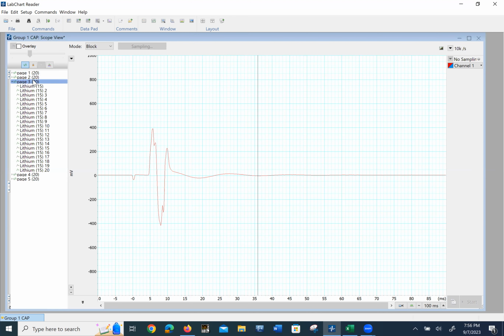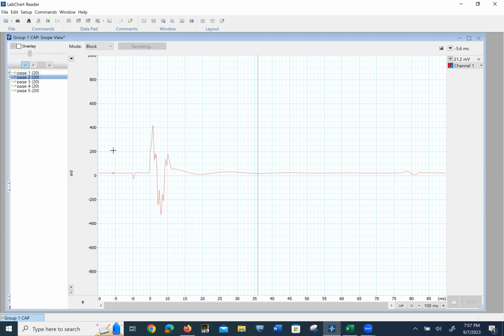Okay, now I'm going to choose the next 20, which is really what? That's 0 time. Let me just pick the peak up there for that. That time is now 5.9 milliseconds. So it's delaying, it's getting longer. Okay, 5.9. Now I want to know the amplitude of that signal. So I'm going to plot this over here. I'm going to move over here. I'm going to plot the amplitude, or at least get the value. There it is. That value is 391. Okay, so 391 actually got larger, 0.2.